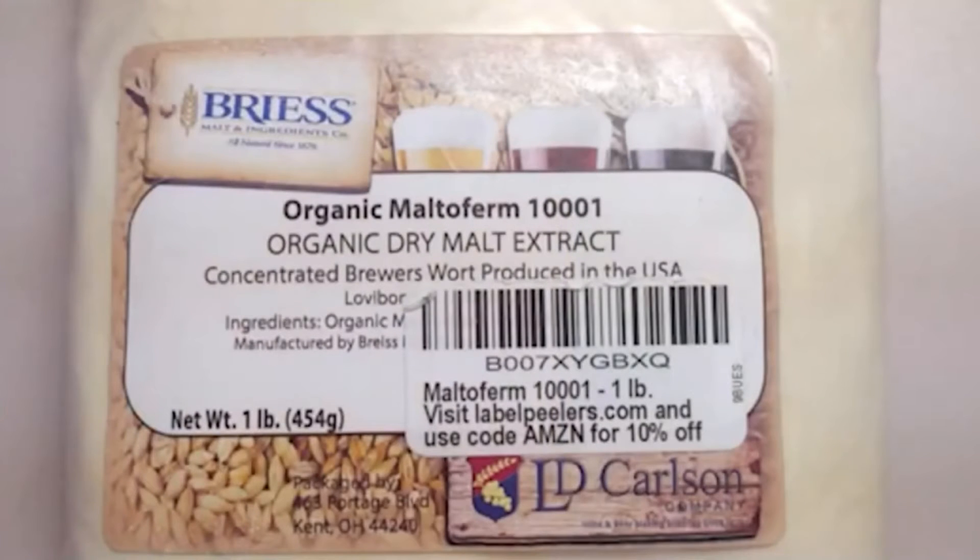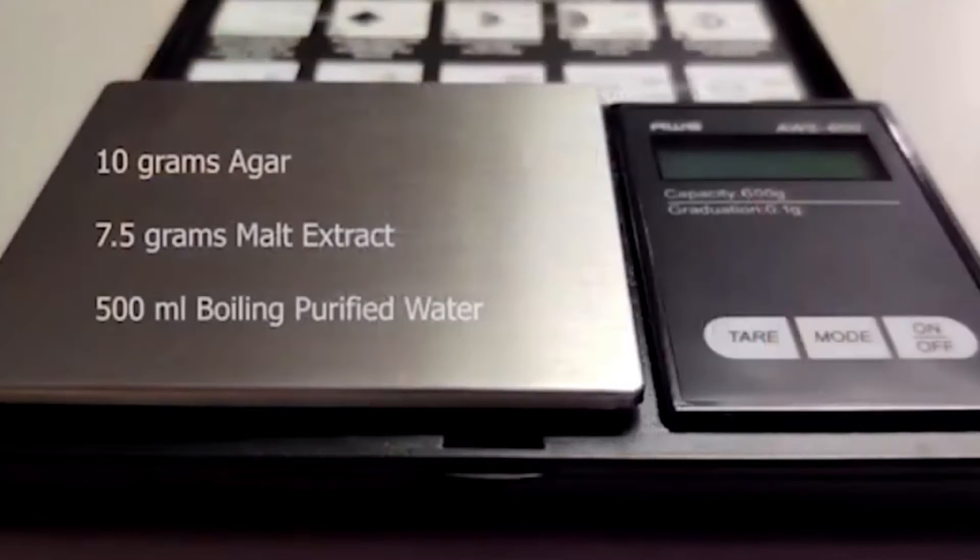We have since come up with a standard MEA recipe that works to promote the onset of rhizomorphic growth while reducing the chance of contamination by using 10 grams agar, 7.5 grams malt extract to 500 milliliters of purified water.